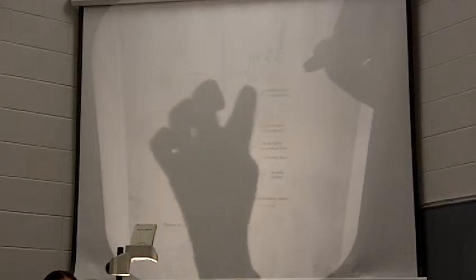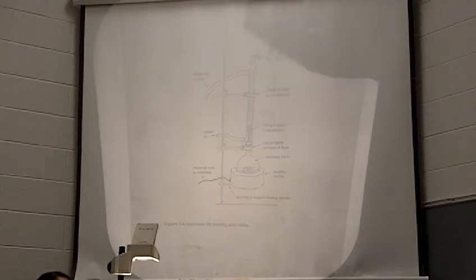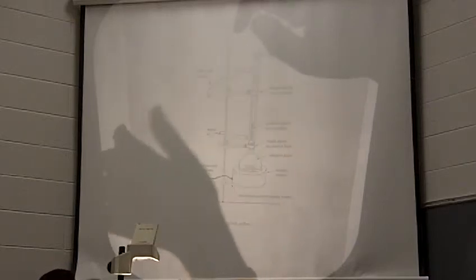And then you also want to put a clamp here, but this is not clamped on tight. You want it there to support it, and you want it there loosely, but you don't want it clamped on tightly, okay? And the reason for that is when we're done heating, we want to be able to raise that whole apparatus out of the heat. So we want it loose enough that it's just holding along the condenser, but not such that we can't move the apparatus up and down, okay? And then just like with our distillation, we had water in on the bottom and water out on the top, okay?